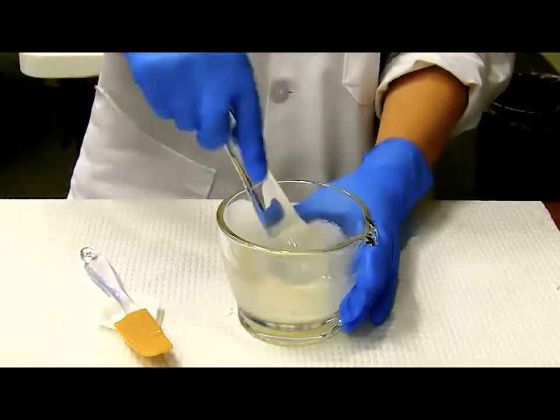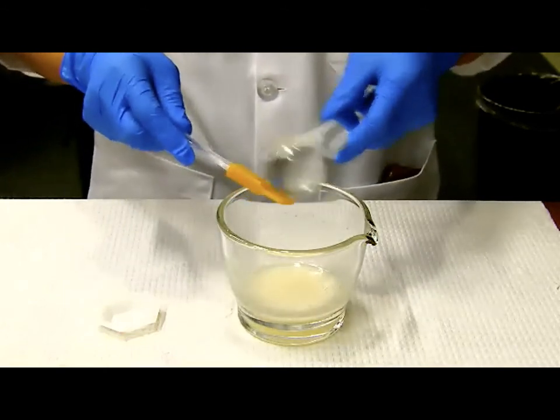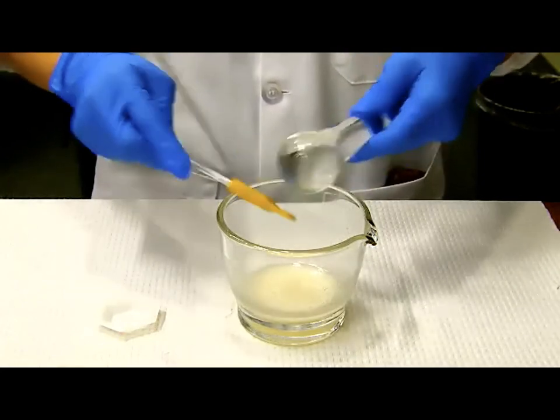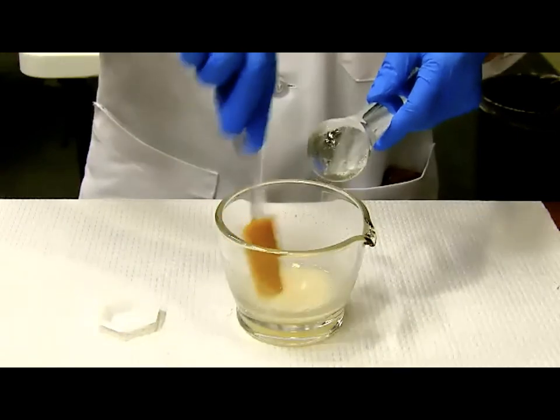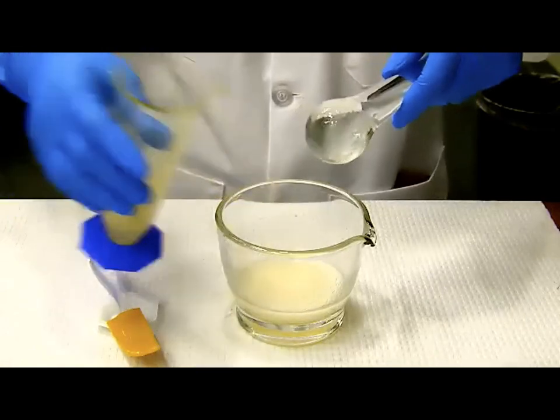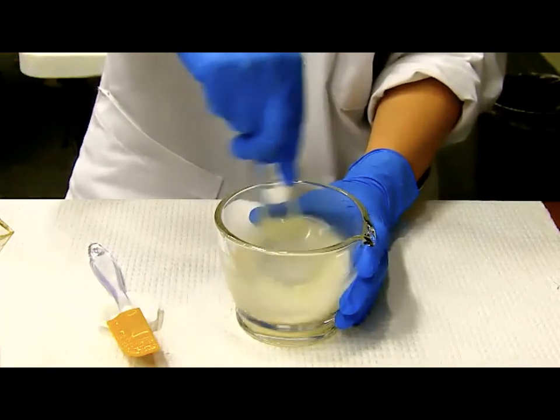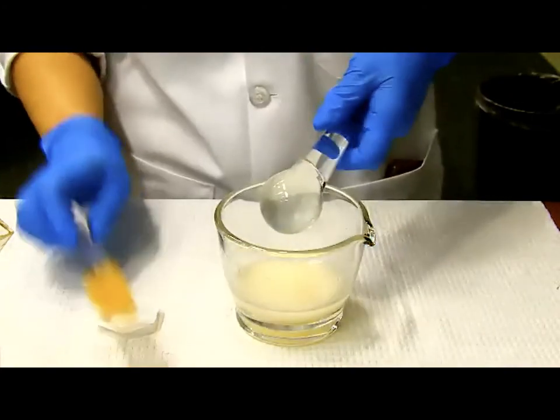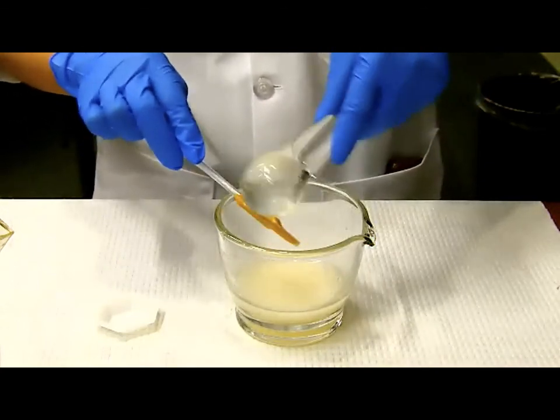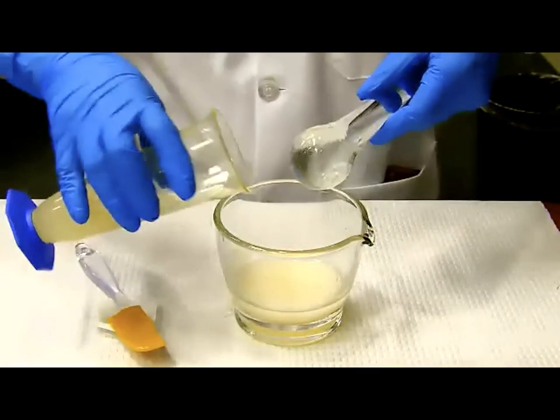Okay. And again, I want to clean my pestle. Especially, I want to clean my rubber spatula because I got some drug on it. I don't want to lose those drugs. Okay. All right. So here comes our fourth addition. Let's go ahead and mix one more time. Okay, one more time I want to clean the pestle, and especially my rubber spatula, to make sure I'm not losing active ingredients. And here comes the last addition.